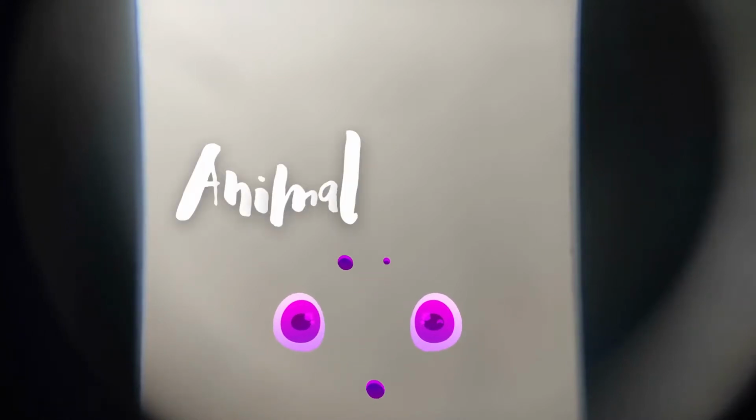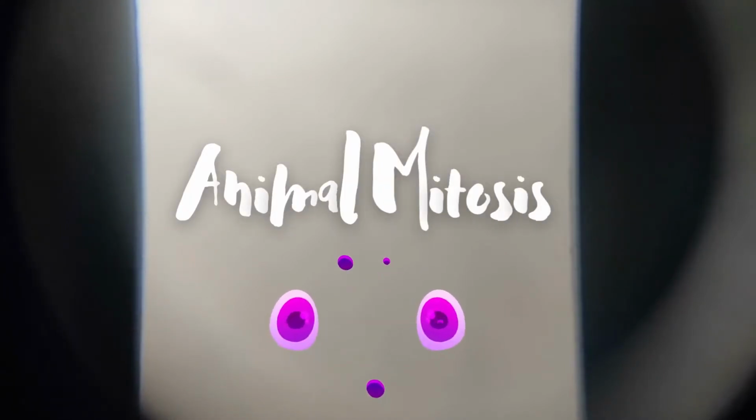Hello everybody, it's me Antonio, and for today you're going to learn animal mitosis using a microslide viewer by the National Teaching Aids Incorporated. The following slides show a magnification of 750 times. This means that the microscope was set at that power when the photograph was taken. So now let's begin.